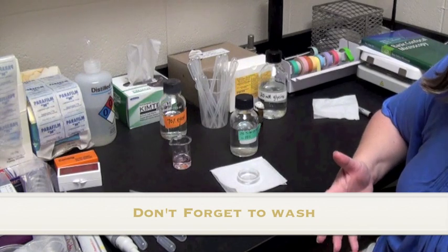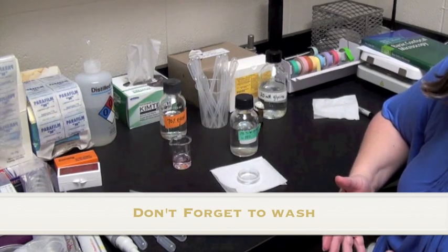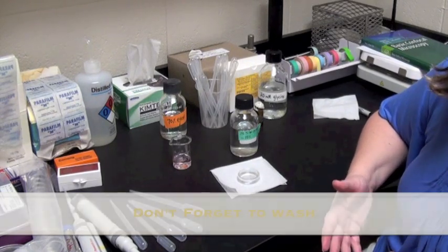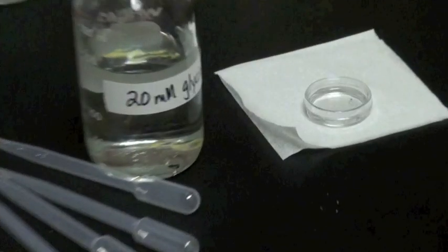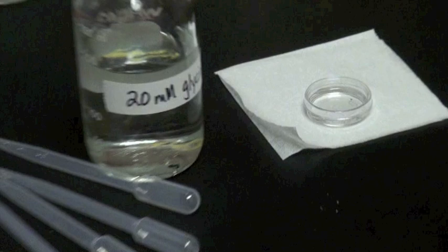Once you've permeabilized your cells, you'll then wash them to make sure that they are detergent free, and at this point your cells are ready. Now a lot of people ask me things like can I fix my cells or can I permeabilize them and then leave them for the next day?